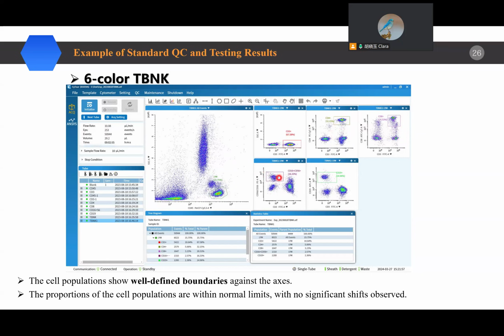Okay, here, this group of cells are CD3 negative, but CD16 and CD56 positive. It's like this. And we can see here are also some table here. Why we have to set the table here is based on the test item or the doctor's needs. So if the doctor say, I need the table like this, you can set the table here.